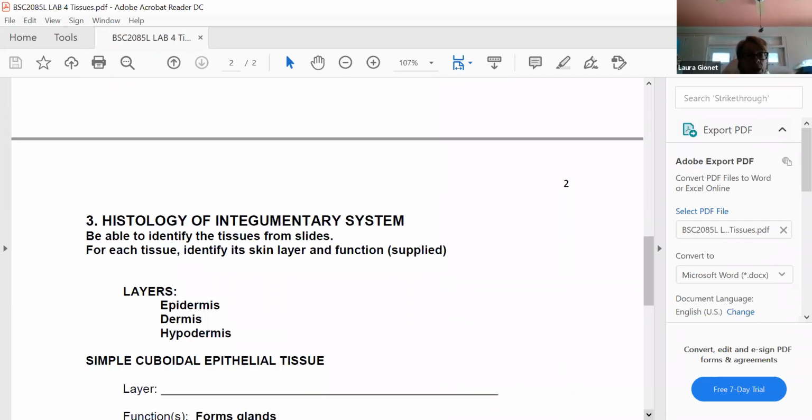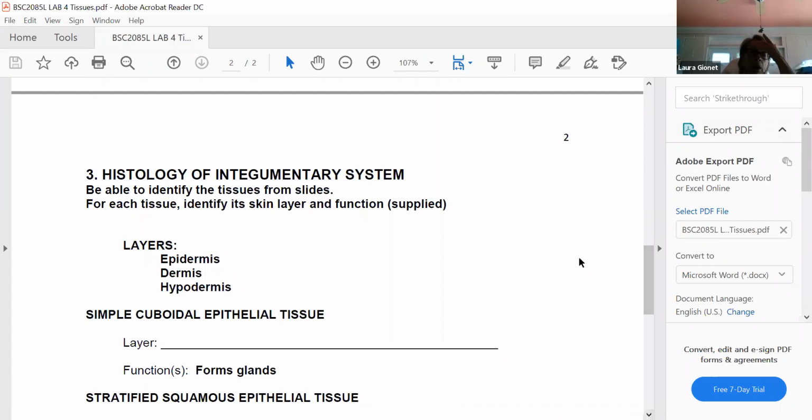And then we move on to the histology. All right, so then we're gonna look at some slides. Hopefully there's some pictures up there, in the images. I don't rely on those images so much. They're really a supplement to your studying and what you do in lab. But if there aren't reasonable examples of them in there, I will upload them this week.